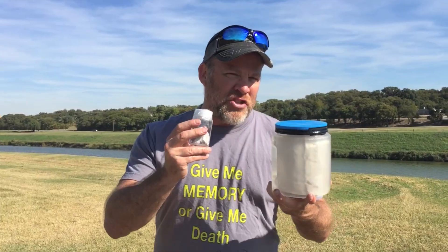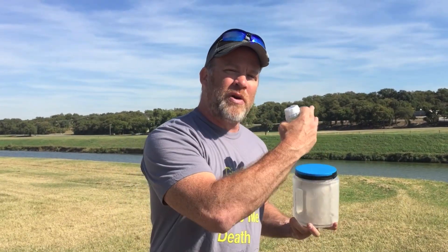Okay guys, I have got some sodium metal in these jars, and I've got some water right over here. I'm getting ready to put this sodium in there and watch the reaction.